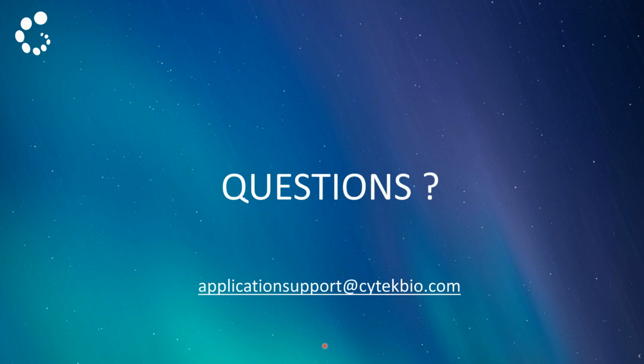Great, thanks for clarifying that one, Maria. The next question I've got for you is: before you run a sample at a different site, does Cytek do any adjustment of the instrument? When the instrument is delivered and installed, the engineers go through an installation process, and they will run many different tests to ensure that, as I showed, the performance is comparable.